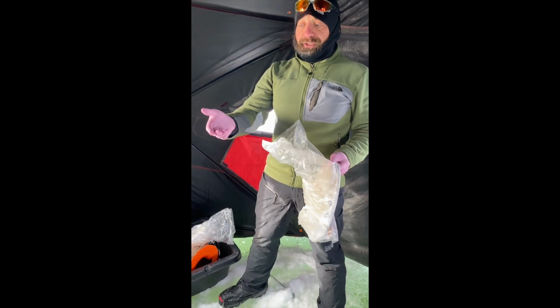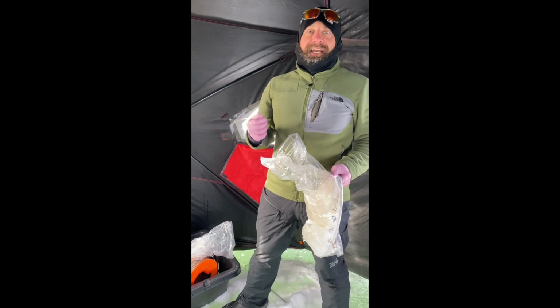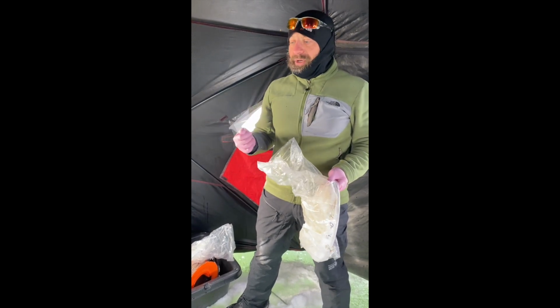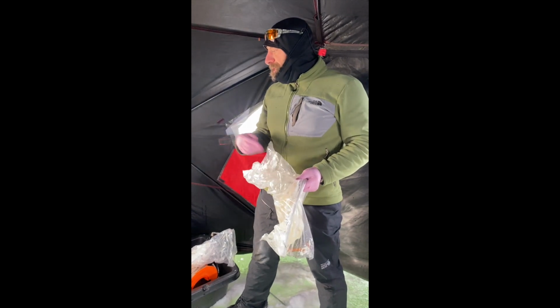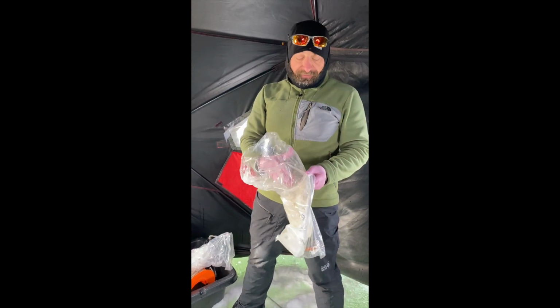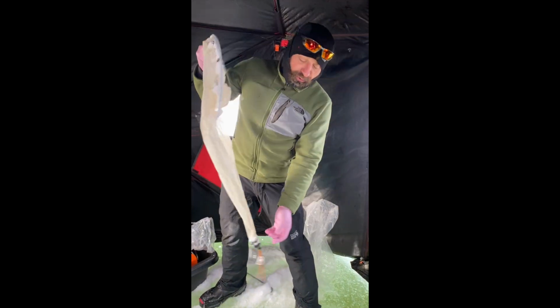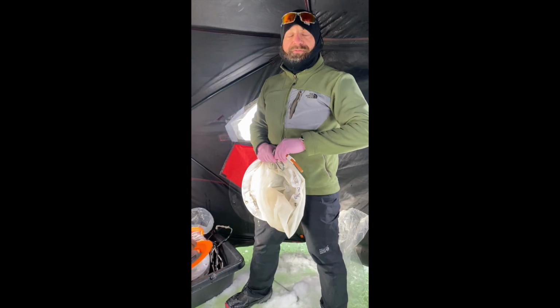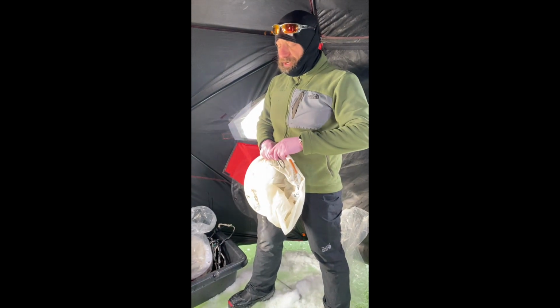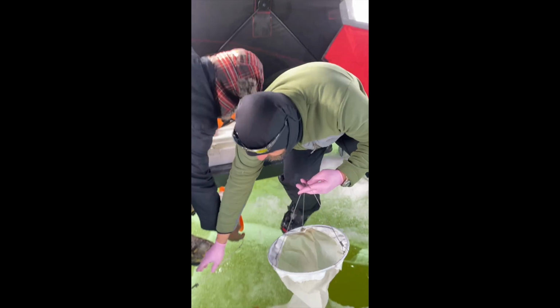Once we do the quantitative tow samples, we're going to do a collection for fatty acid and stable isotope analysis, which we'll show you in a second. Basically, we're doing our tows from surface to 1 meter above the lake bottom, using a moderate tow speed of like 5 seconds per meter or something like this. So I'll show you what that looks like.